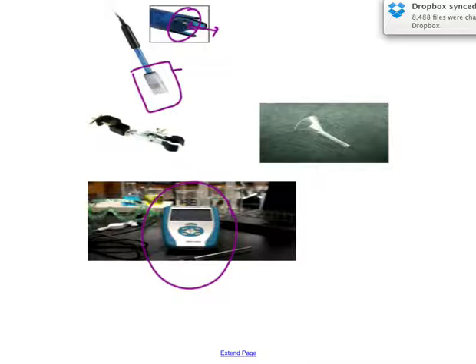You have to unscrew, if you can see it there, there's a little top. The top stays on the actual pH sensor, and you unscrew the bottle part. So this bottle comes off, and you leave the plastic top piece on. And that's what you connect here. And so you put the pH sensor here with the plastic top holding the pH sensor. Okay, and I'm going to show you the full setup in a minute, but this utility clamp will hold the pH sensor in your solution as you're titrating.